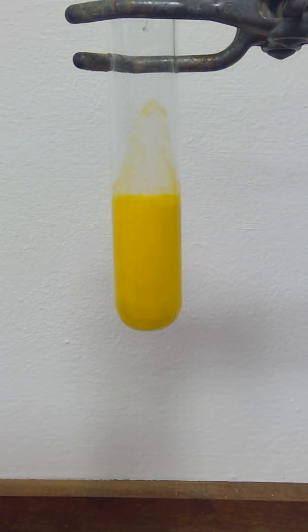So once again, a precipitation reaction has occurred and a yellow solid is formed. This yellow solid is lead 2 iodide. The lead ions from the lead nitrate solution have combined with the iodide ions from the potassium iodide and have made the insoluble lead 2 iodide. Once again, there will be spectator ions.